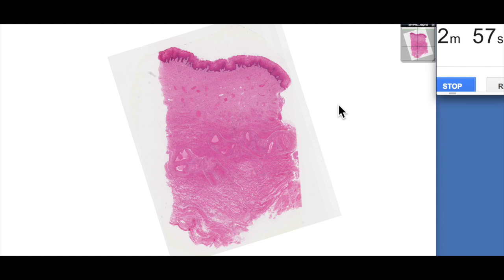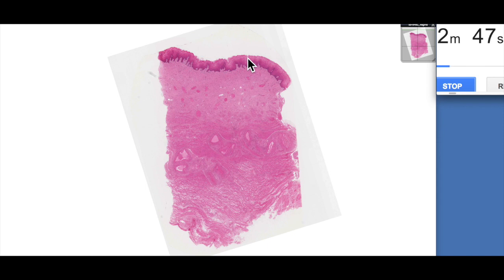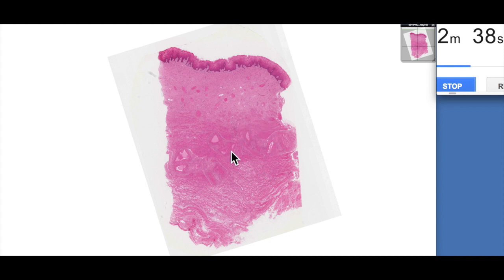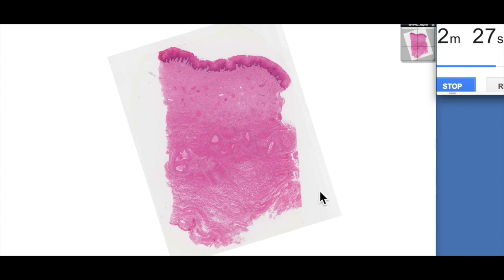At a broad histological description level, the vagina consists of an inner mucosa consisting of a stratified squamous non-keratinized epithelium and a fibroelastic lamina propria. Then a very indistinct muscularis layer consisting of an inner circular and a longitudinal — not in the typical sort of bands that we see in the gastrointestinal tract, so much more haphazard. And then an outer adventitia.